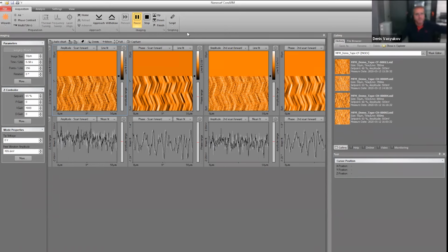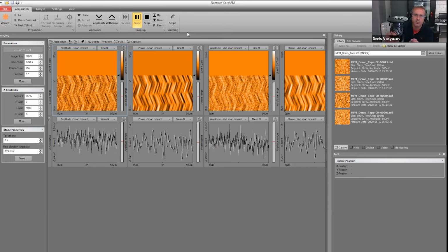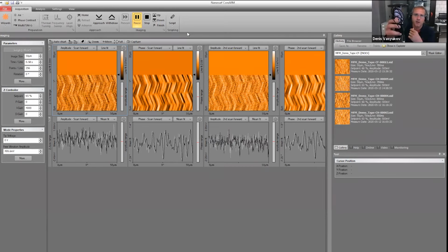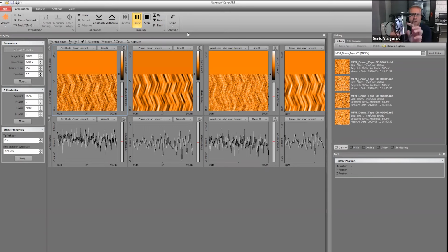So this device here is a variable magnetic field holder. You put your sample here in between the two magnetic poles. This part and this part are hard magnetic steel, and inside there is a motor with a rotating magnet.